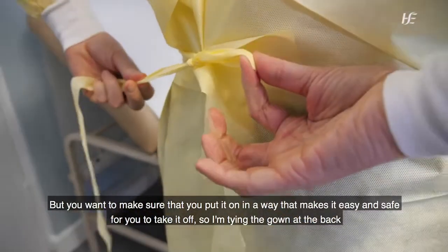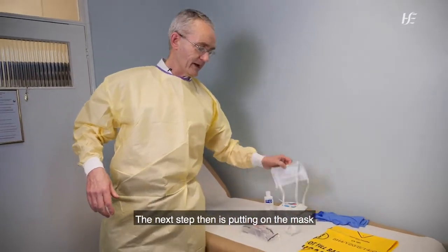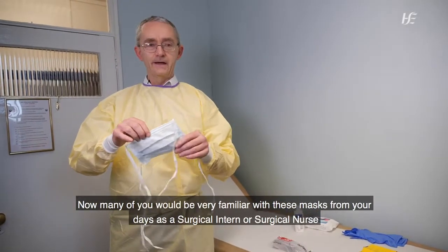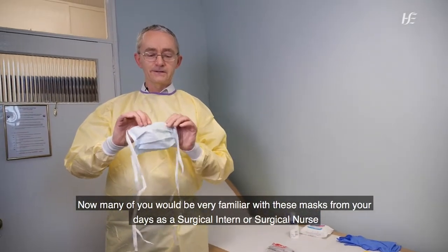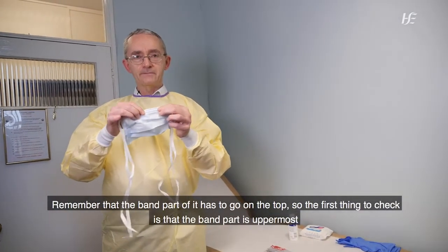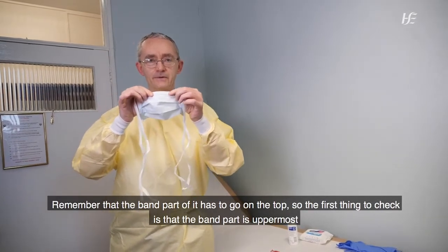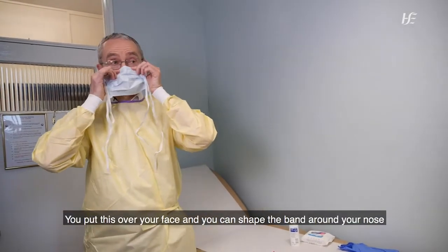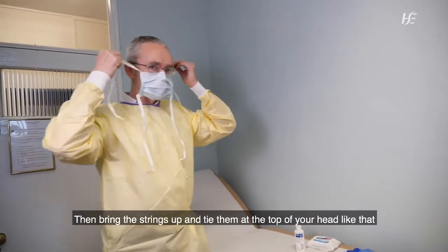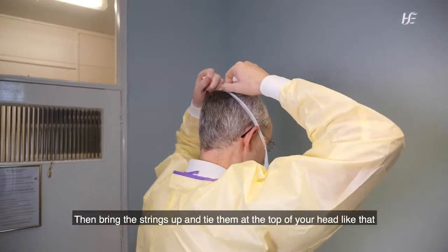So I'm tying the gown at the back. The next step then is putting on the mask. Now many of you will be very familiar with these masks from your days as a surgical intern or surgical nurse. So remember that the band part of it has to go on the top. So the first thing to check is that the band part is uppermost. And you put this over your face and you can shape the band around your nose and then bring the strings up and tie them at the top of your head. Like that.